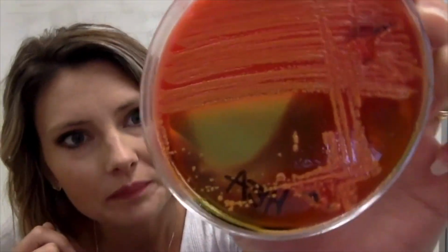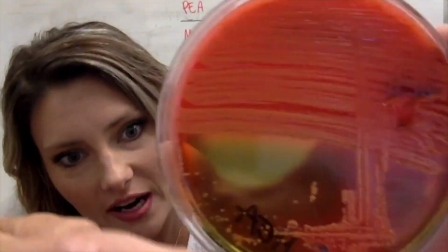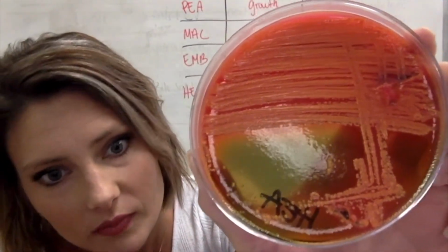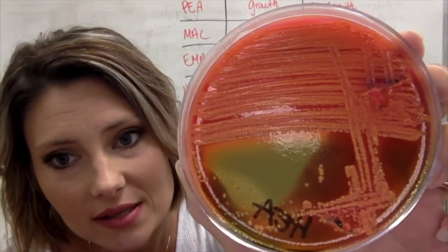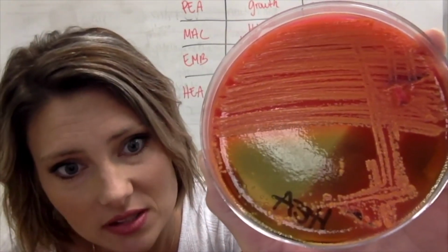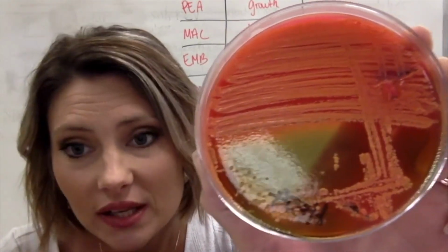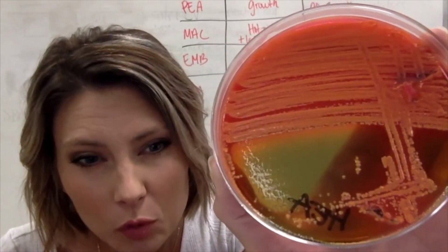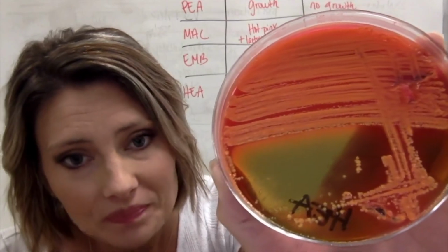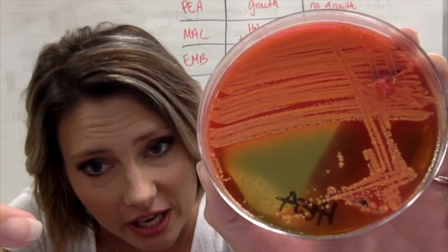It's most indicative right in that deep spot. Like I said, sometimes you get the black, sometimes you don't. This one we did get some black, so that's good. That's what we want to see. If I were to let this go a little bit longer, you might get a little bit more black, but I wanted to go ahead and make the video for y'all and get it posted. So this would be a negative result for HEA.